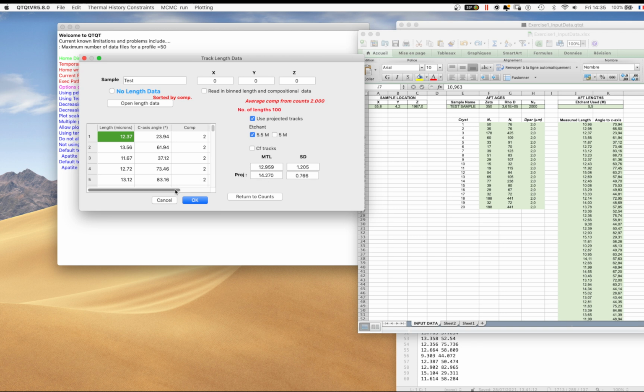And then hidden a wee bit here just on the right, you get the projected lengths in microns to compare to the unprojected lengths if you ever want to do that. We can define Californium tracks if you want to, up to you.